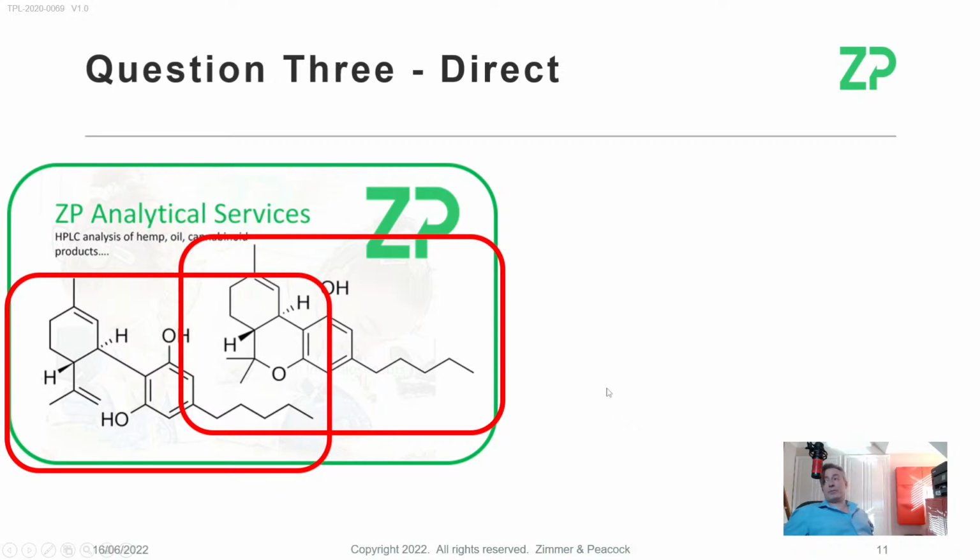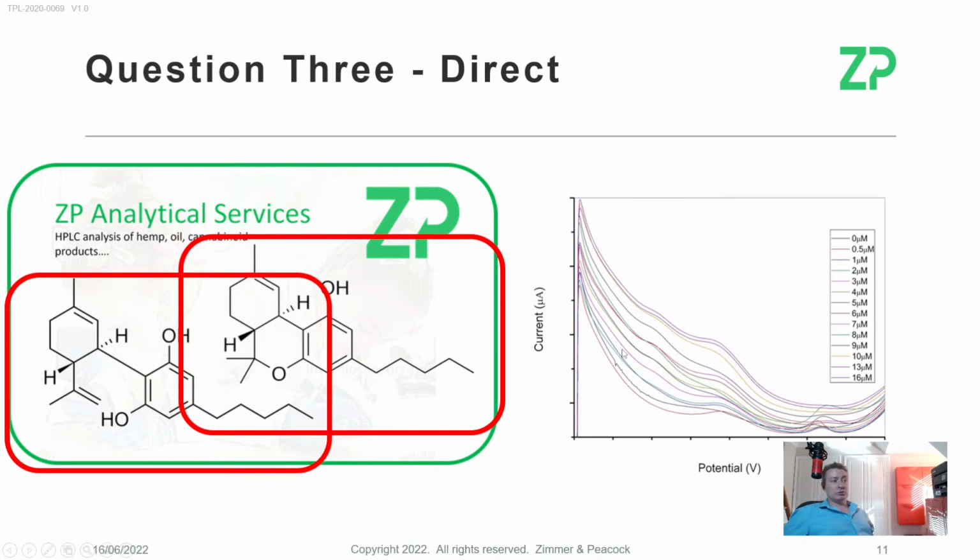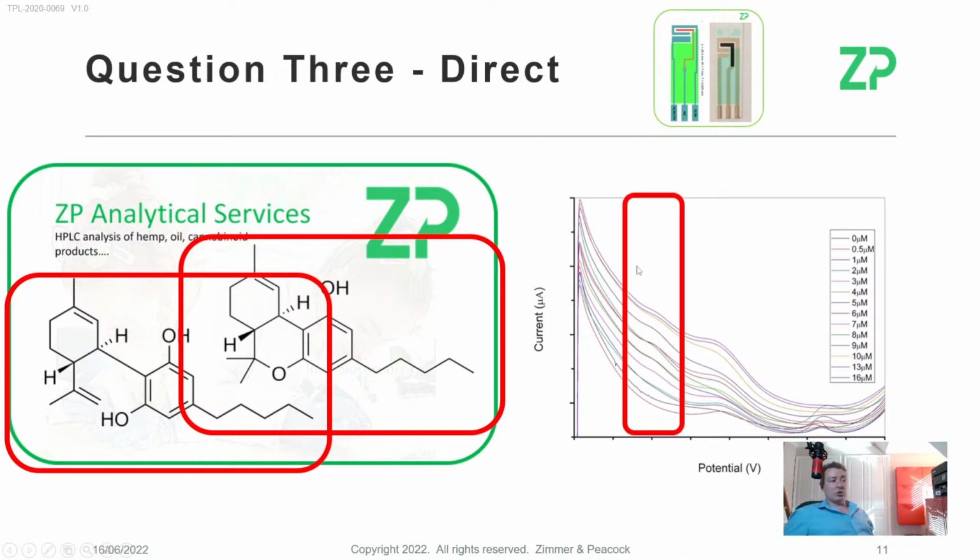Because there's now a legal market for the growing and use of these products, people are actually interested in being able to detect these molecules and quantify them. So ZP, we actually have done some work, and I say here the word direct. So we have done some direct detection of CBD and THC on our electrodes, and so we know that our electrodes are intrinsically sensitive to these molecules. If people are interested, they can connect with us and contact us.